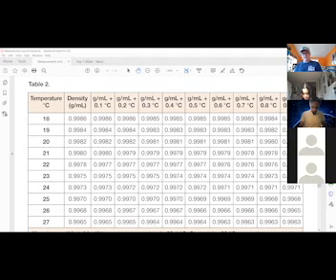Mine's slightly different, so I don't know. LD, yeah, it means there's something wrong with it. We might need to replace your balance. So you're just getting LD every time? Yeah. Weird. If you put it to ounces, do you get the same thing?